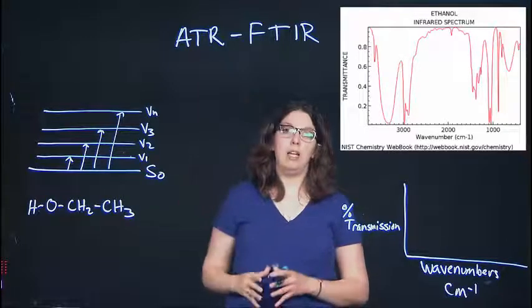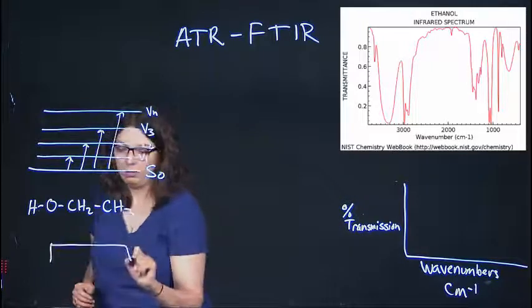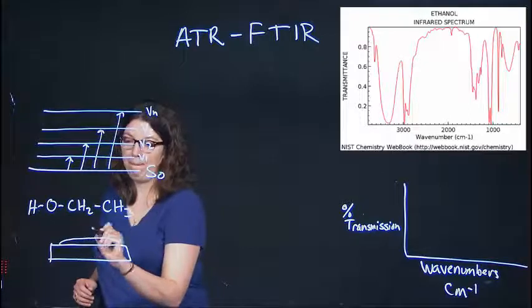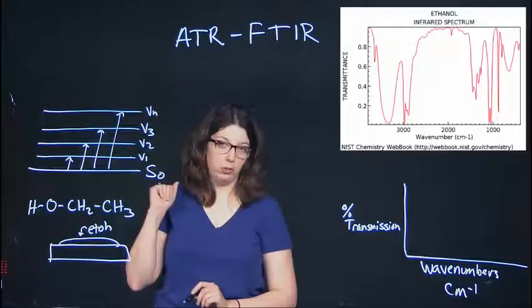So that's where this ATR comes in. ATR is a crystal upon which we'll put our sample, ethanol, in aqueous solution.